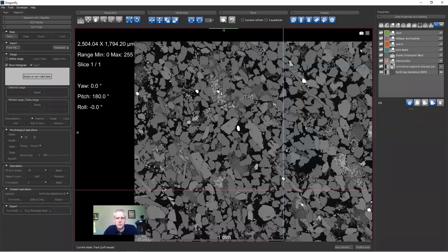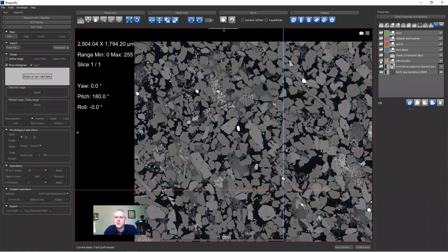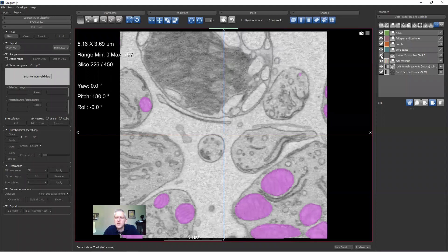Those template-loaded ROIs are empty and ready to work with — I'll delete them since I don't need them right now. Let's look at some other ROI tools features. I'll set aside the sandstone by hiding it and look at the rod internal segments and the mitochondria data for a few minutes.